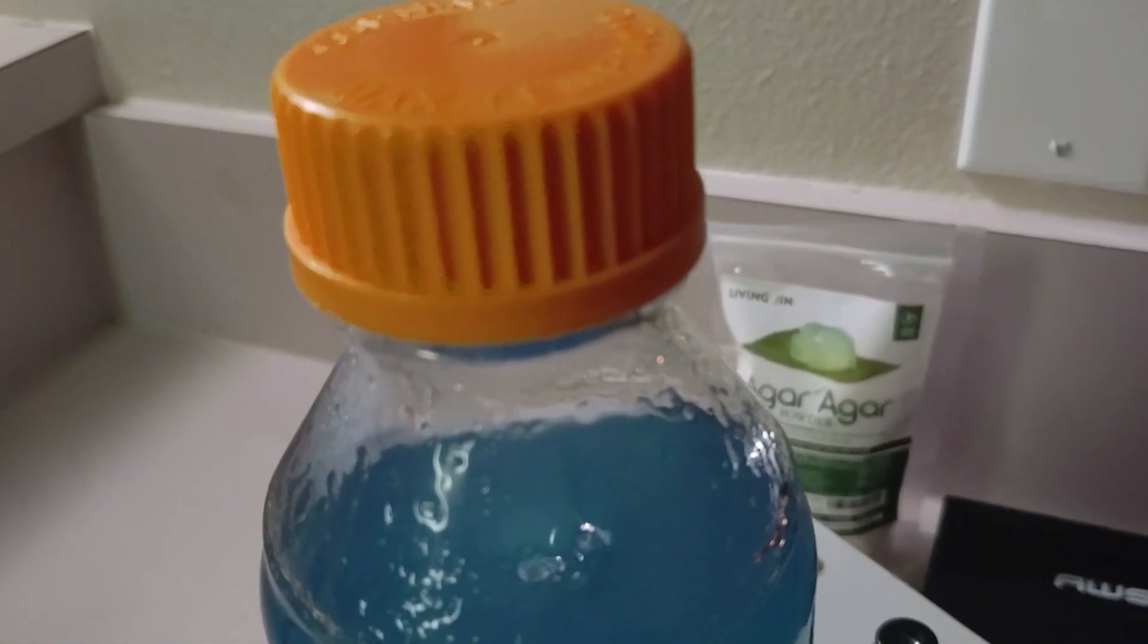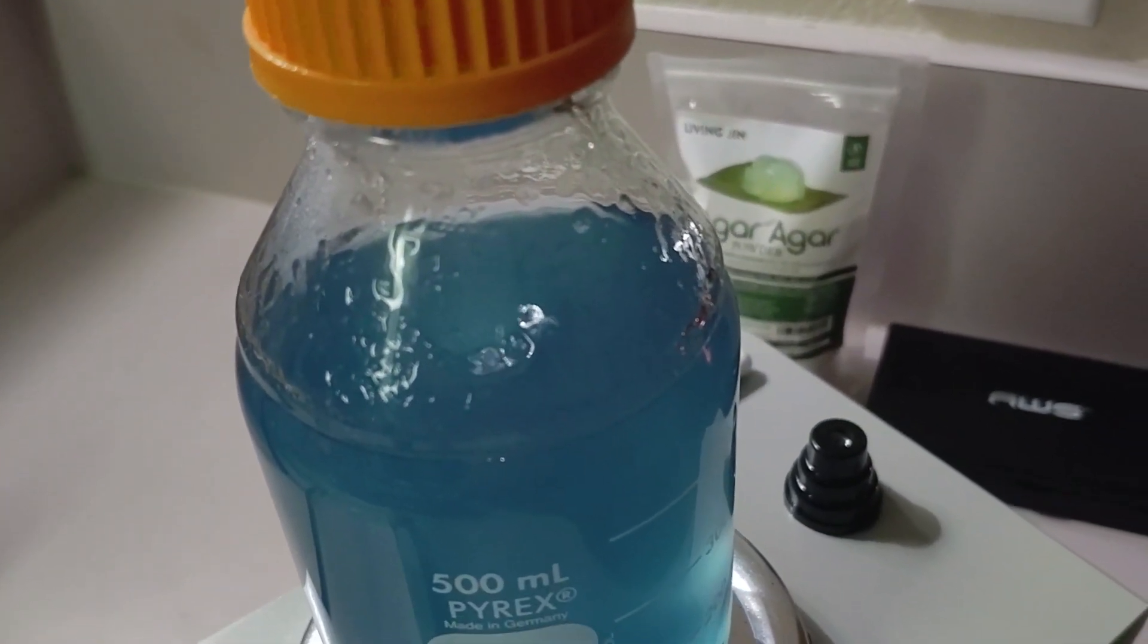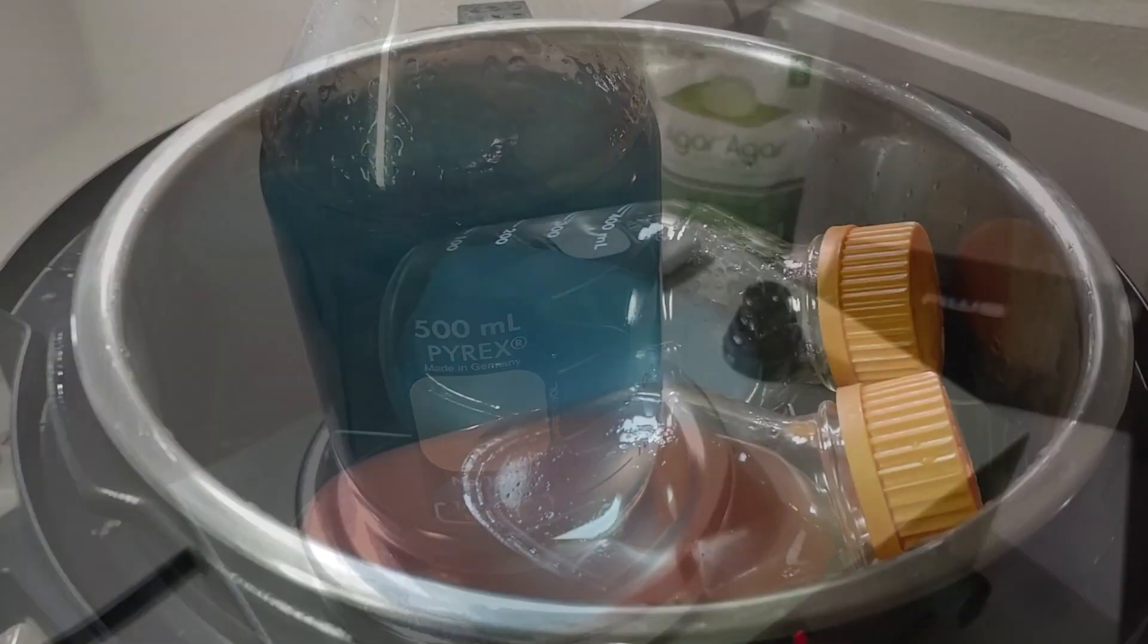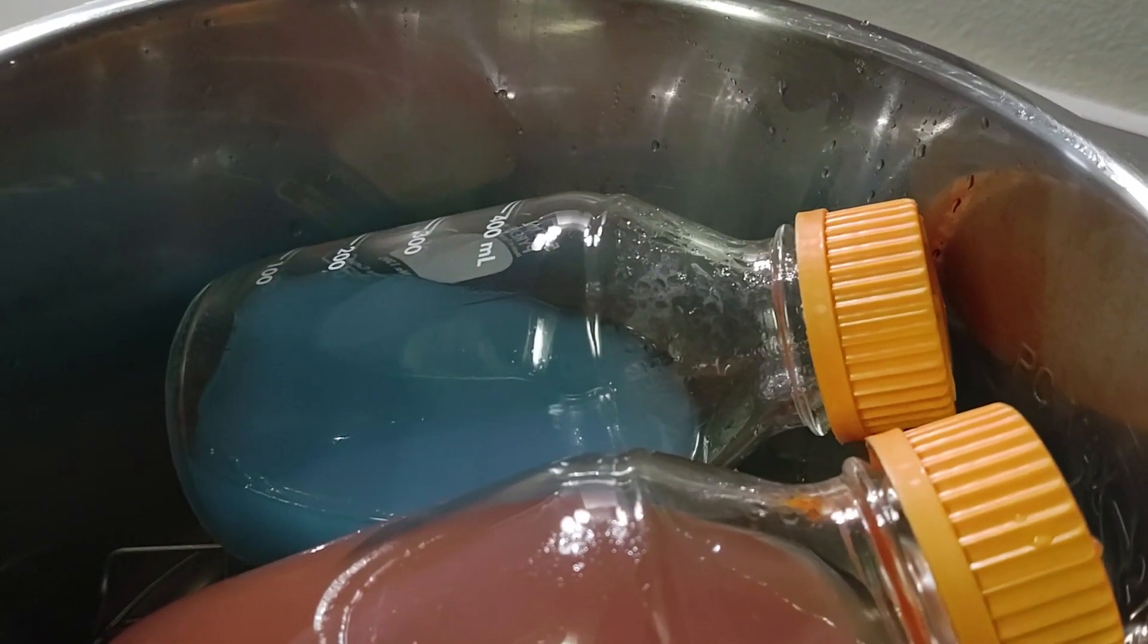Once you have allowed the agar to completely dissolve without clumping then you're ready to sterilize in the pressure cooker. This usually takes about five minutes with the heated stir plate.